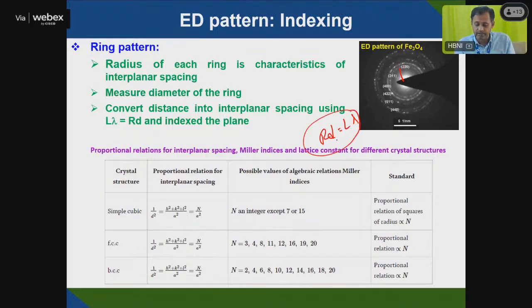In that case my scale is in nanometers, like 5 nanometer, 1 nanometer in the TEM, like the old image that you get on photographic film. But nowadays most TEMs give an inverse scale, 5 upon 1 by nanometer. When that 1 by nanometer scale is there, this equation is taken care of by the instrument.